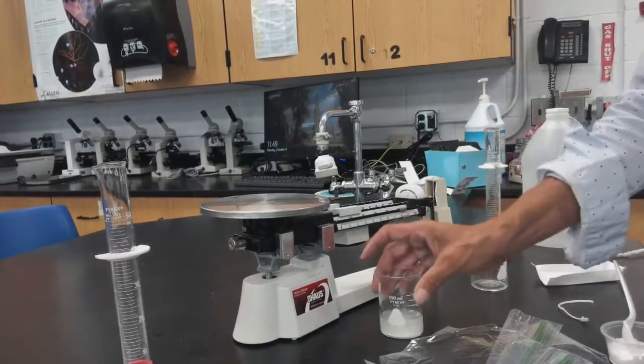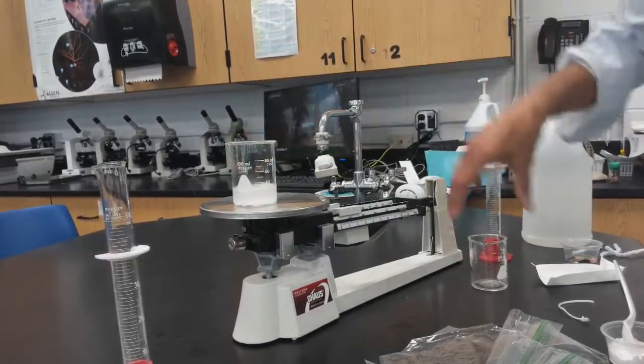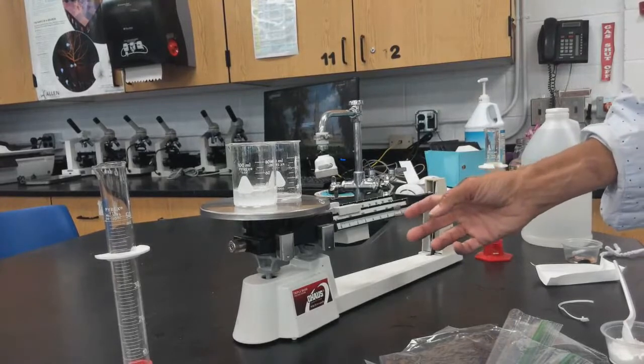Once the reaction is done, make sure there is nothing remaining on the bottom. Then weigh both beakers together and record the mass.